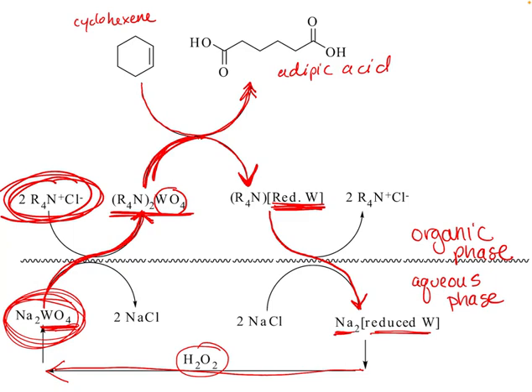Additionally, we said that this is a catalyst. So at the end of the reaction, we saw that we can regenerate our catalyst by using sodium chloride and hydrogen peroxide.